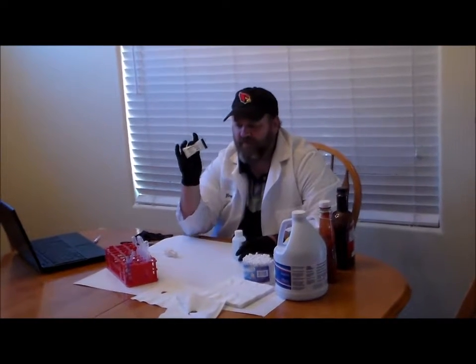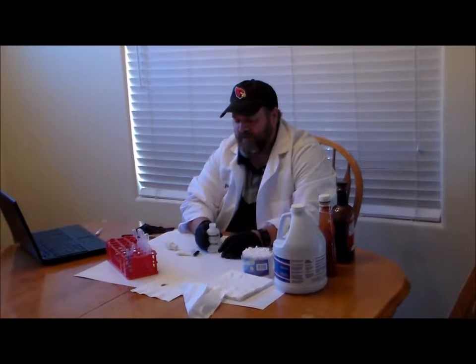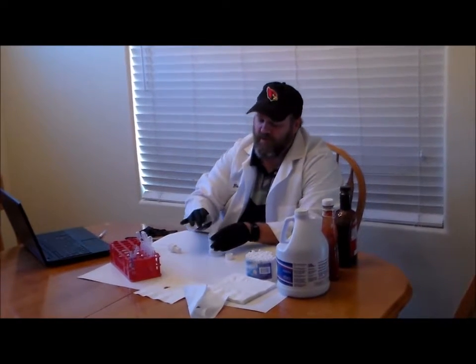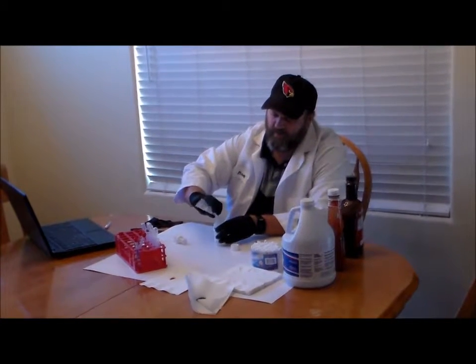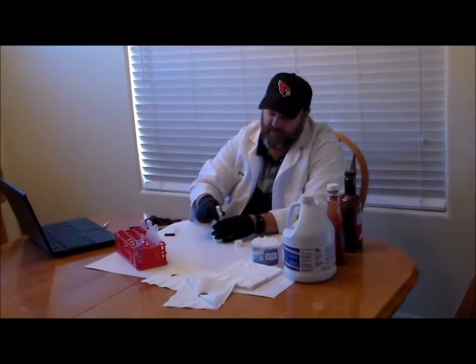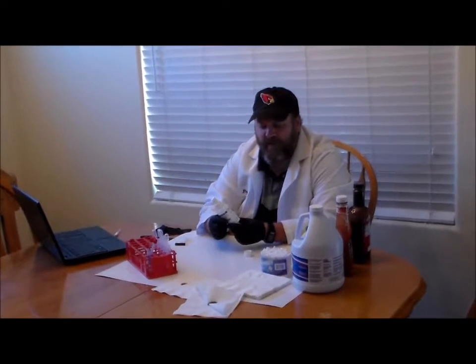Before pouring the luminol packet contents into the bottle, make sure you're wearing gloves. Unscrew the bottle, slide the top off the envelope, and pour the powder into the bottle, then attach the sprayer and shake to mix. Note that this reagent doesn't last long — it will go bad in a day or two, so you want to mix it and use it the same day.